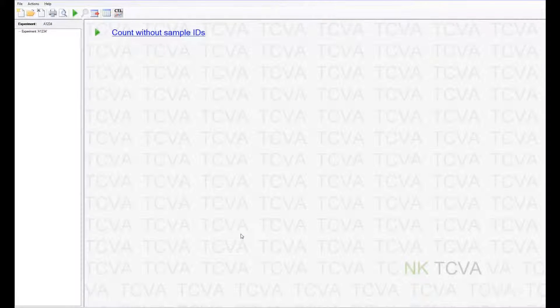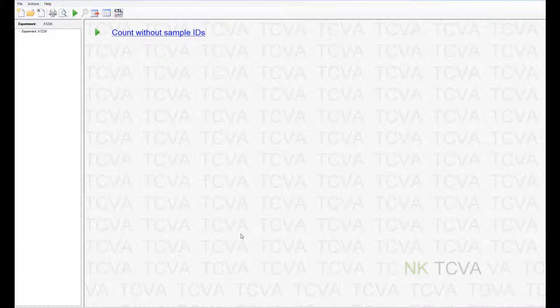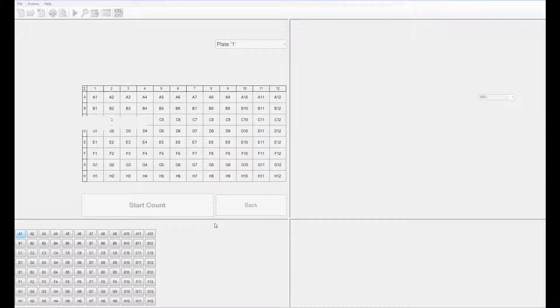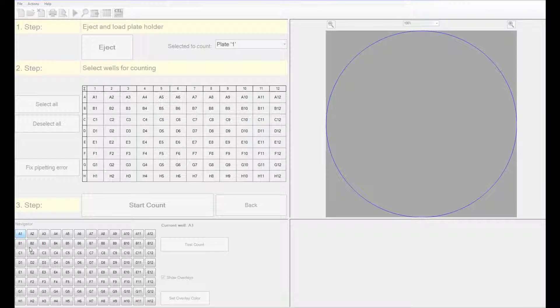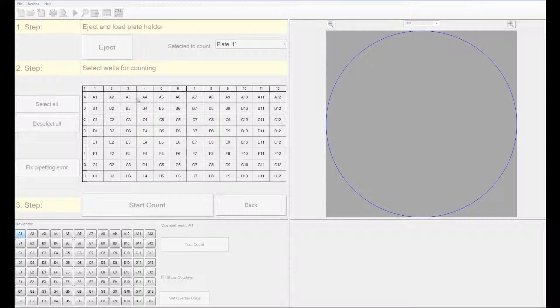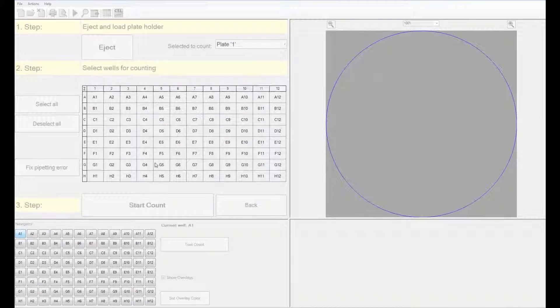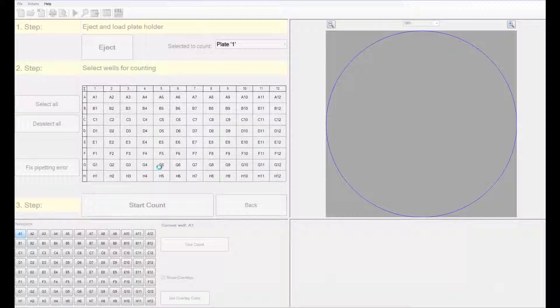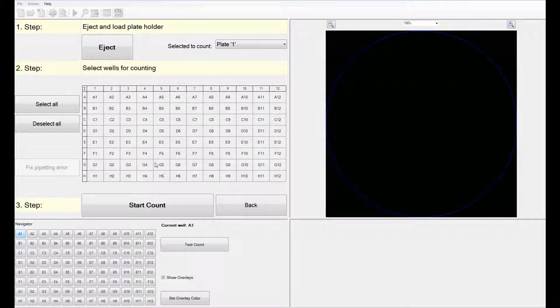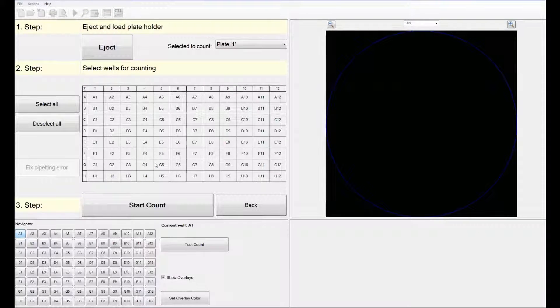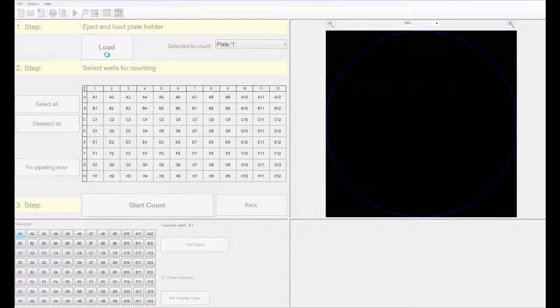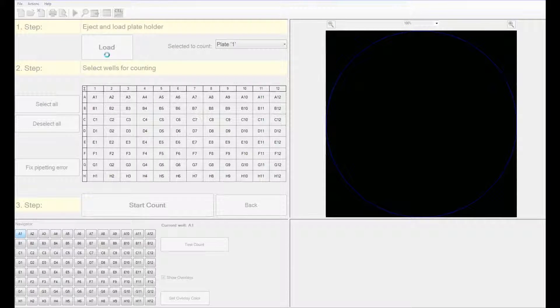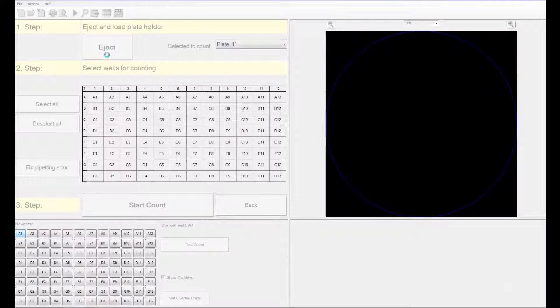Since the plate layout is predetermined, you can just get started without having to specify unique identifiers for each well. The software opens a window that launches the navigation as well as the selection of wells window. The software automatically starts with position A1 of the 96 well plate. Before starting your counts, you have to eject the plate holder and load your plate onto it. If you have a stacker, your plates will be automatically loaded one after another.